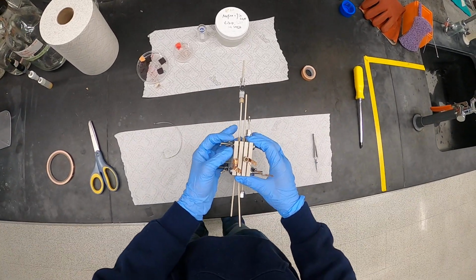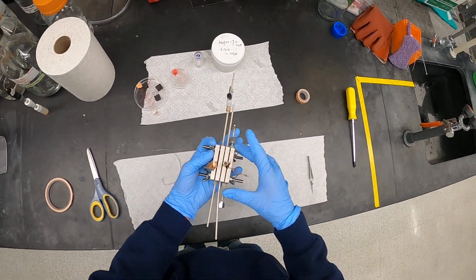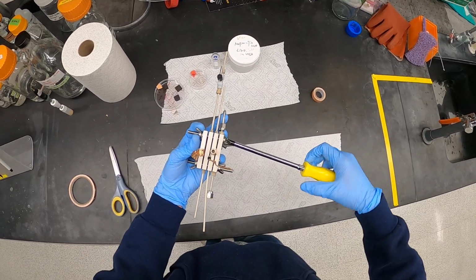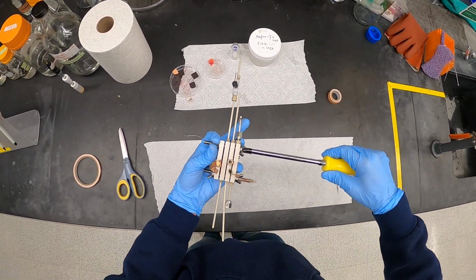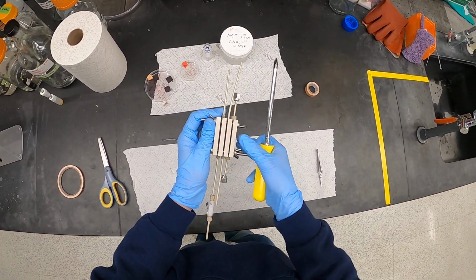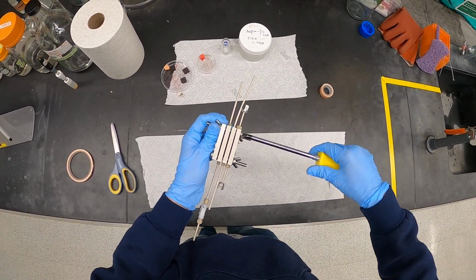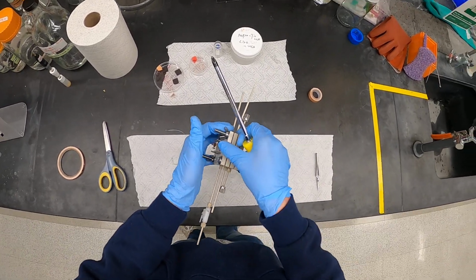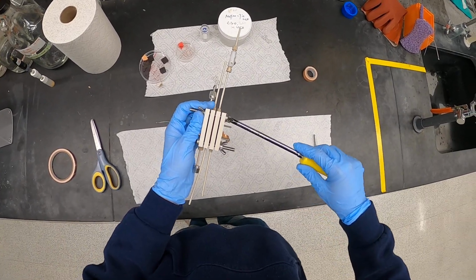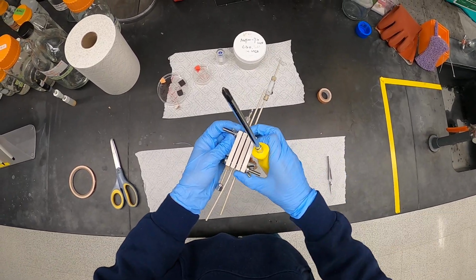So what I'll do is I'll grab it by one of the wing nuts, kind of put my palm on the bottom, grab one of the wing nuts, put the screwdriver into the screw, and tighten as much, not as much as I can, but just tighten it pretty well. And then what I'll do is I'll flip it, so same side, screwdriver on the same side, wing nut on the same side, tighten those 2 until it's relatively tight. Then I'll flip it around and get the other 2. Support it on the bottom and grab the wing nut as you tighten. And the last one.